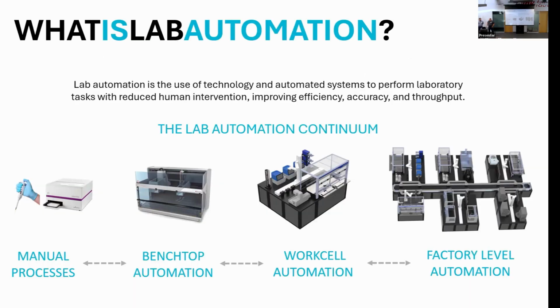So really wanted to think about the fundamentals here, sort of like what is lab automation? And we often look at the work that we do in the lab, and we think about ways that we can improve our efficiency, we can reduce errors, increase accuracy and throughput. And really the only answer for that at scale is automation. But applying it is challenging, and we really need an understanding and a strategy on how to do that and how to go about automation in the lab.